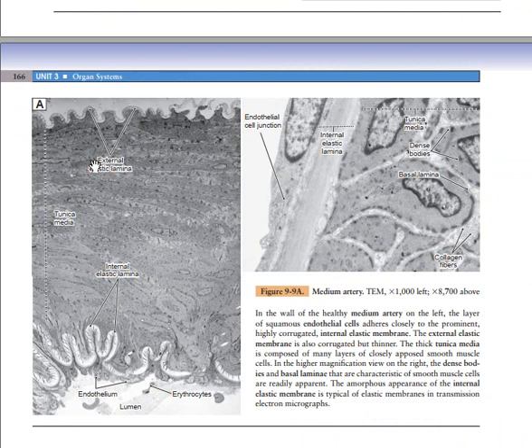So here you can see these are the smooth muscles with many rough endoplasmic reticulum inside. If you increase the section of the smooth muscles, you are going to see that it has a basal lamina and the smooth muscles are connected to each other. Inside we have the dense bodies, and you have different dense structures which are going to be used in the contraction of the smooth muscle.